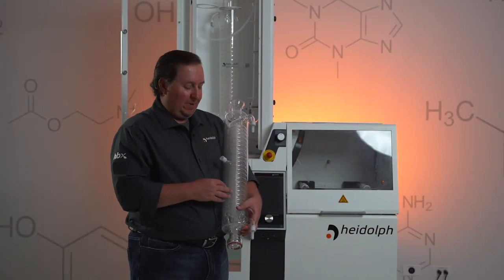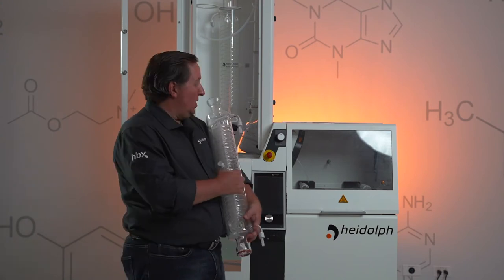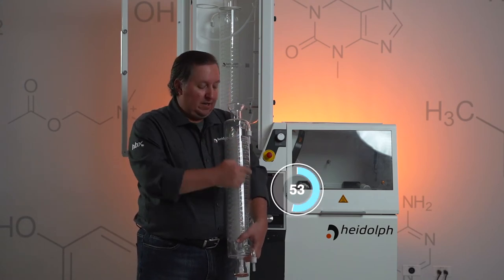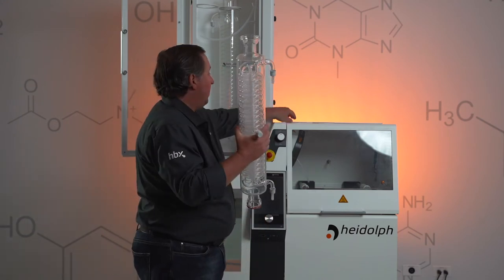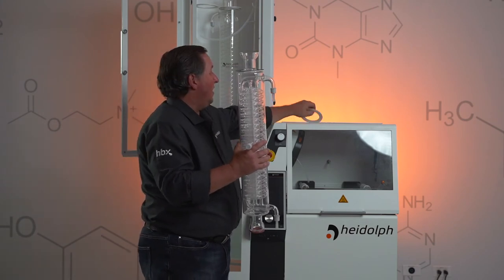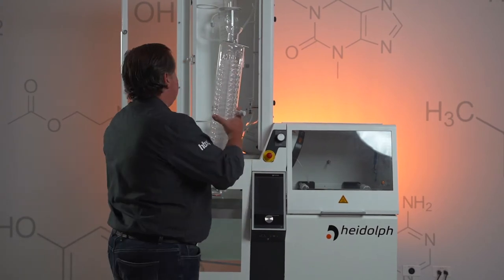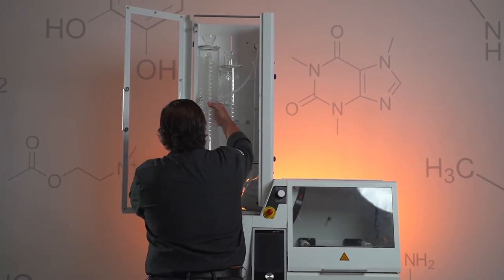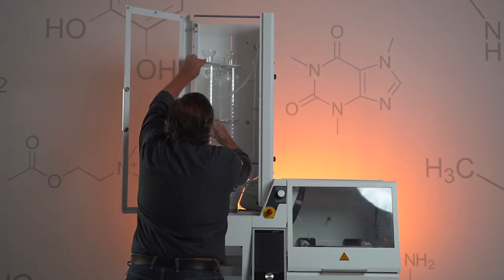After we get our R condenser in place, we want to get our T auto condenser in place. The difference between the R condenser and the T auto is that this port right here is offset 90 degrees from your water supply ports. When we install this one again, we want metal side down on top and metal side up on the bottom, and you want your two water connections to go towards the back left corner. Slide it up through the bracket, lower it into place, and just make sure that top bracket comes down along with it.